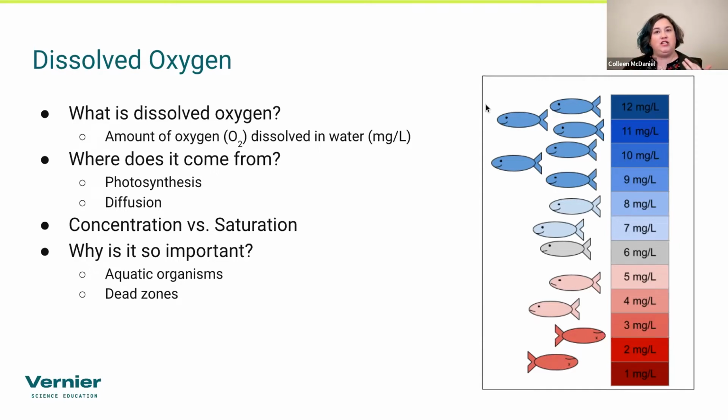With concentration, we're looking at how much is actually present in our water sample at that moment, while with saturation, we're looking at how much our water has the ability to hold on to when it's fully saturated.